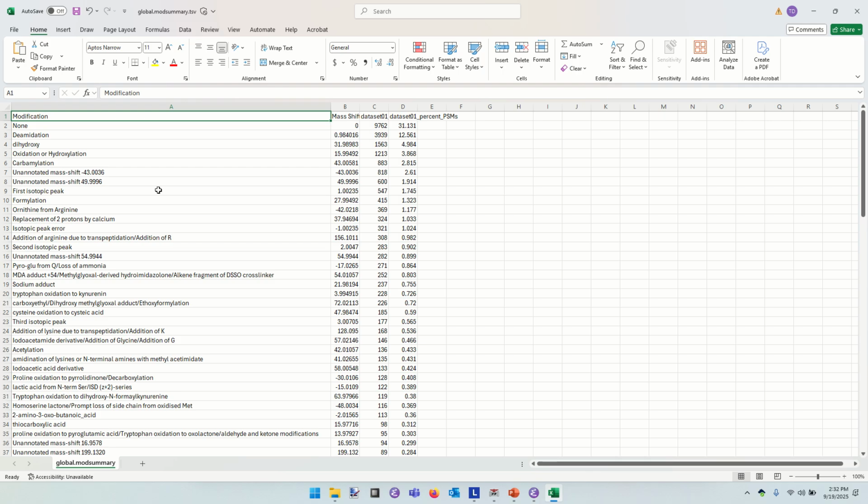So if you had an OH that got added onto and replaced an H on a methionine, we call that an oxidation. If it happened twice, you'd have a dioxidation. So a dihydroxy is what this is. Does this tell us what amino acid that occurs on? No. I don't see that information yet.